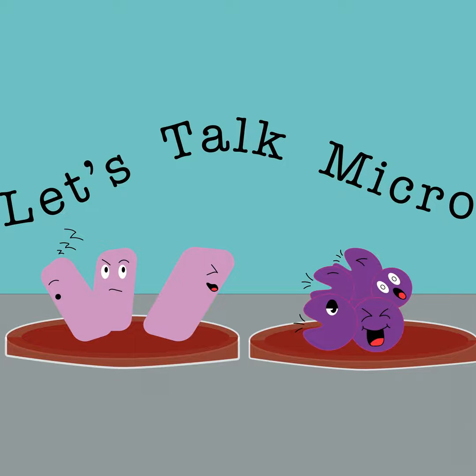And for me, on the other end, a lot of what I learned, I still use today. They're still uploading their pictures, because I found that's a much better way for me to look and show them what their micrographs are really showing, rather than them looking through the microscope, me moving their head over, and then me looking through the microscope and pointing with the pointer. Still uploading the pictures has worked very well. And I also allow them to choose some specimens of their choice to do staining on and look at, because that gives them a sense of excitement and ownership. So a lot of what I've learned, we're still using in the laboratory today, which has really been very nice.